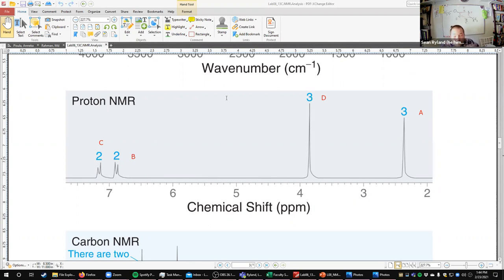And again, this is also something that lends itself to multiple choice questions, even on closed book tests, like the MCATs. Because even the way we labeled it kind of sets itself up to be a multiple choice question. Here's your structure. Here's the NMR spectrum. Which of these protons accounts for this signal, for signal one? And then you would have to say proton A accounts for signal one.